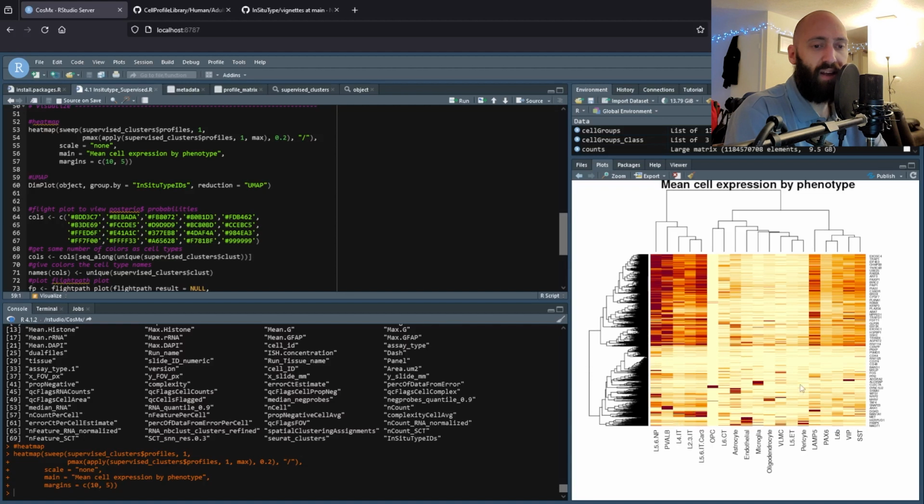So you might expect the immune cells to cluster together in this sort of thing. You might expect particular tissue cells to cluster together if you know that you have very distinct lung cells. So this is another QC look that you can just visualize and see, okay, yes, my cells are making sense for the gene expression that was assigned to them.